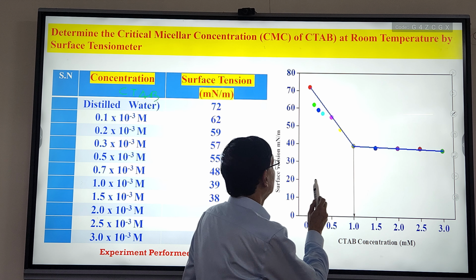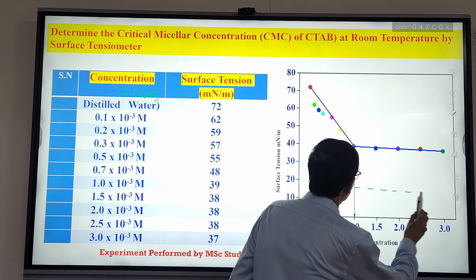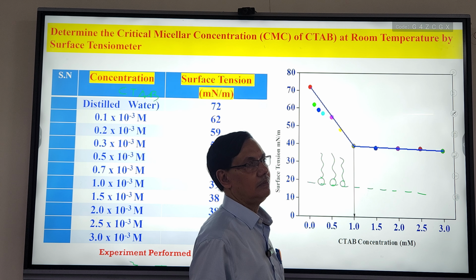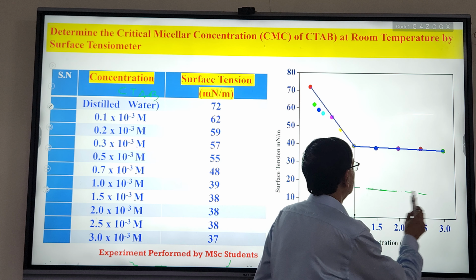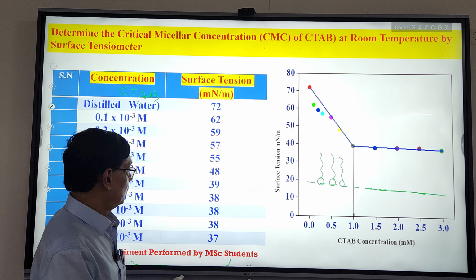And because you know that, मान लीजिए ये आपका वाटर है, तो ये because it is hydrophobic in nature, as you increase the concentration, the whole surface is covered by that surfactants, and ultimately it will also break the water structure. So therefore the decrease, and एक समय आएगा जब ये whole cover is, and they will prepare micelles.